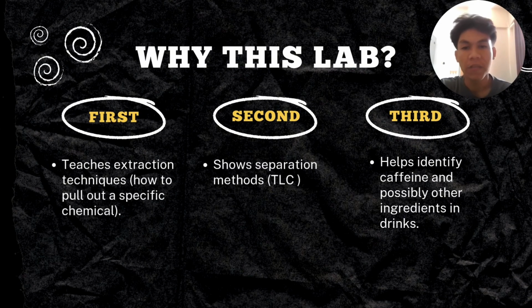The objectives of this lab are: first, it teaches extraction technique, how to pull out a specific chemical. The second objective is that it shows how separation methods like TLC are done, and the third is that it helps identify caffeine and possibly other ingredients in the drinks.